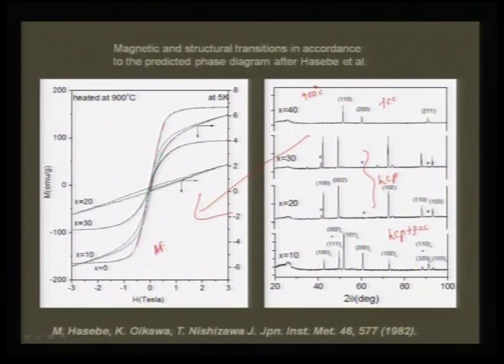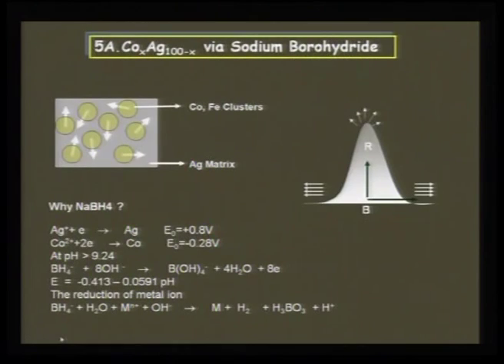All this can go hand in hand when you map your X-ray diffraction pattern. So, this becomes very useful to understand how the magnetic transformations affect the structural disorders and how the structural impurities can alter the magnetic signature. So, a competing interaction between AFM and ferromagnetism in this cobalt chromium is actually linked to the structural changes that are happening.